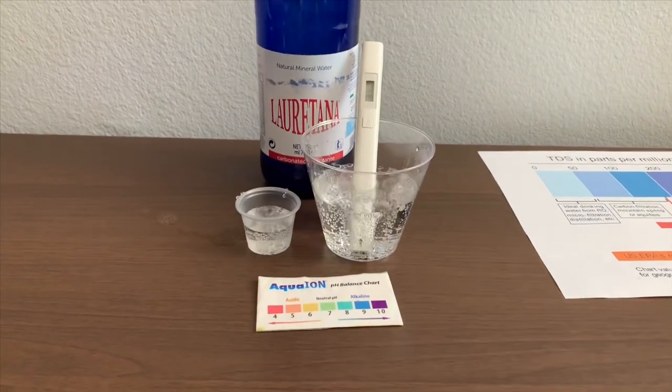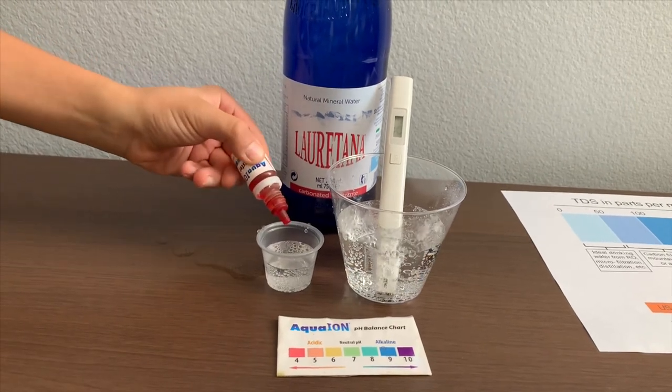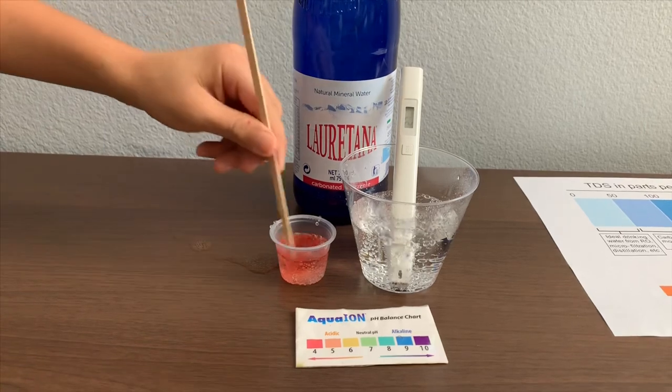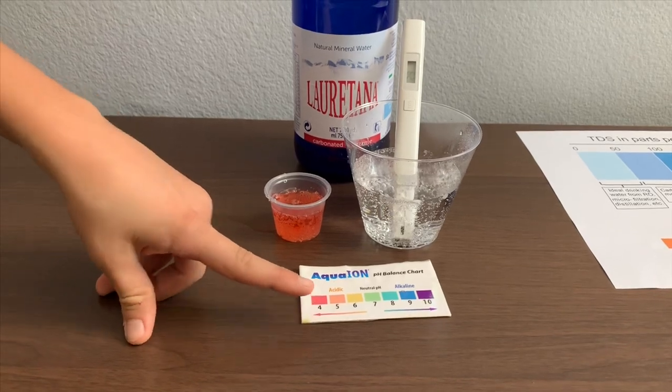Now let's test the pH level. If you want to buy this pH tester, check the link down below. Only do two drops. Let's stir it a little for a better result. I give this a 4.5 — this is acidic.